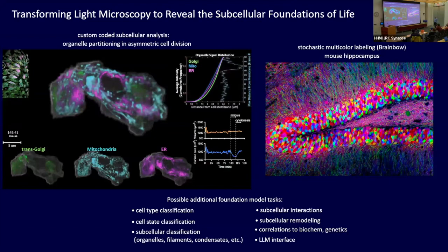And then finally, in the science fiction-y version, you would have many, many, many petabytes of multicellular data with subcellular resolution that would be addressable to biologists through a large language model. They could just say, please tell me what happens to the mitochondria in this type of organism when a neutrophil has to go through a confined space. And that's how you would interact with it. It would start to give you data information related to that.